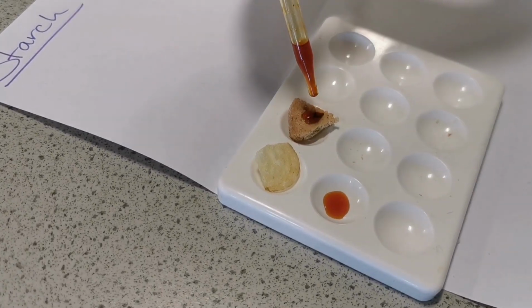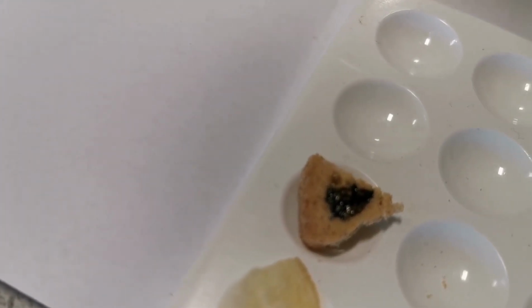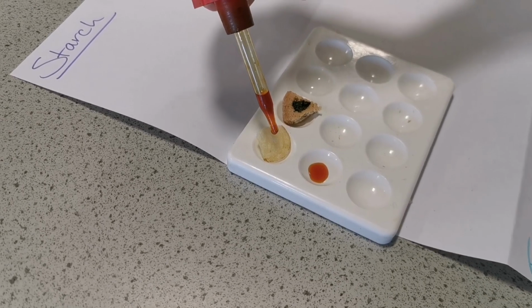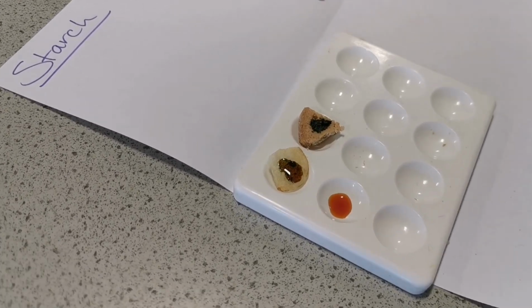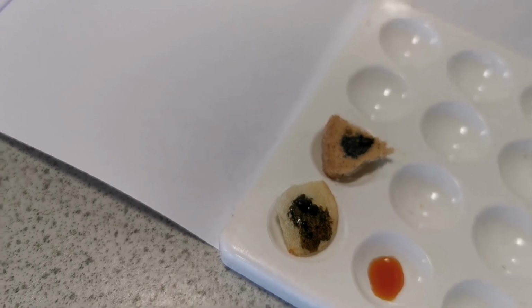Let's do the biscuit first. Let that work. And yeah, you see it's going very, very dark there. And that is definitely a positive result. That is blue black. Let's do it again with the crisp. What are we going to find out? And a nice blue black colour again, really, really dark. That means there is definitely starch in those foods.